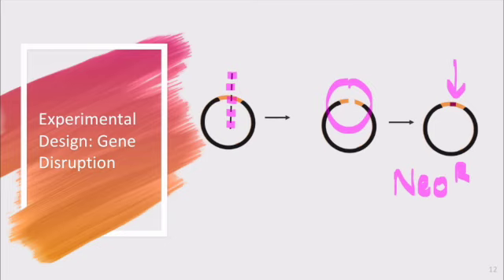This is an important factor because when testing to see if the Tetrahymena contains the disrupted gene, it is placed in a media containing neomycin. Only the Tetrahymena containing the disrupted gene will survive because of the resistant gene they now have. This insertion of a new DNA sequence into the gene of interest disrupts it, rendering it non-functional.